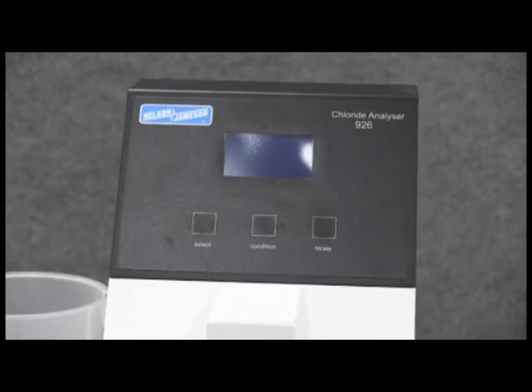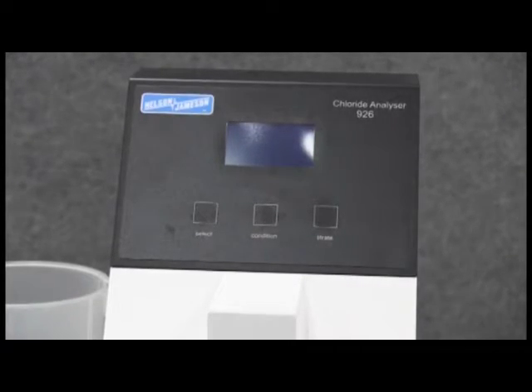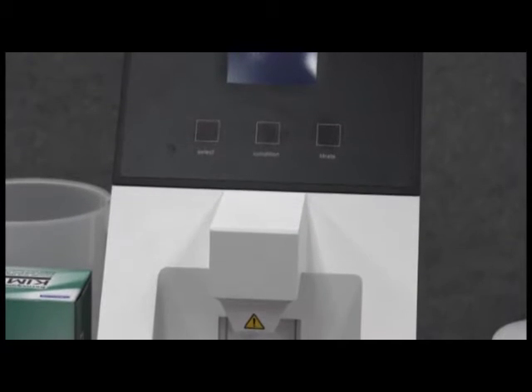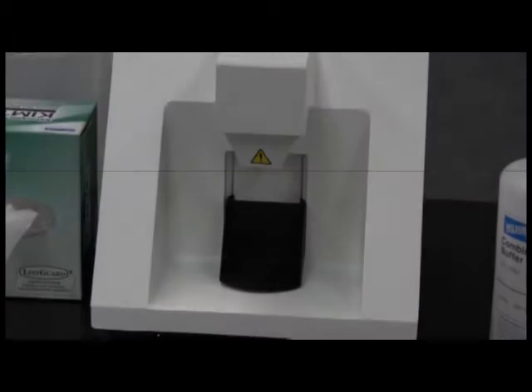Welcome to the basic operation for the Nelson Jameson M926 Chloride Analyzer for Precise Chloride and Salt Determination. The M926, or simply 926, is designed for measuring total soluble chlorides in foods. However, it can also measure chlorides in many other products.